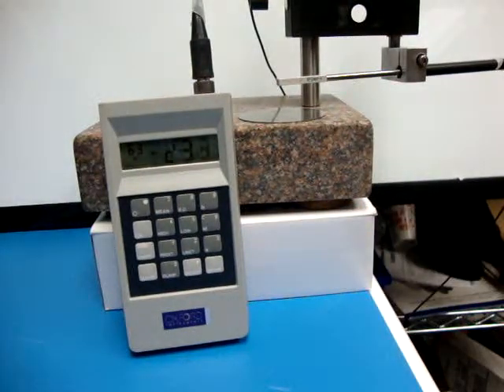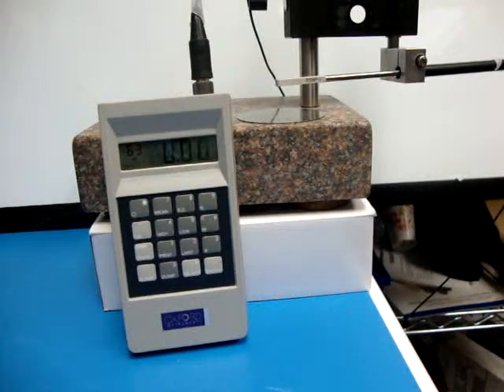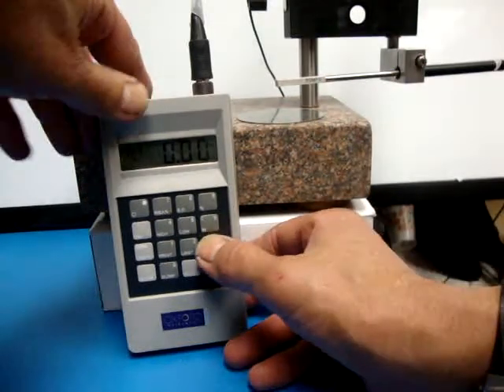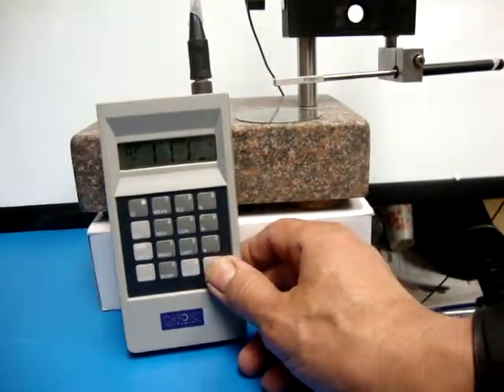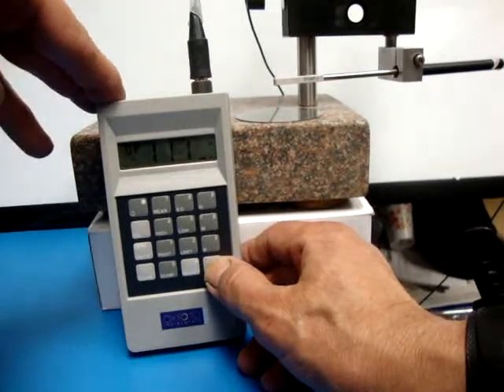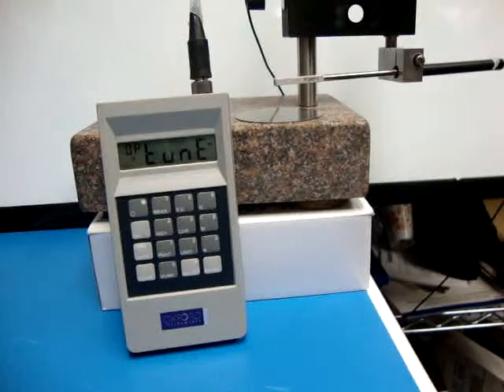Now since every probe has a different offset, the next thing you have to do is tune out the offset for the probe. So you're going to want to do a star 1, 1, 1, and then hit enter. And now it's tuning out the offset for this individual probe.